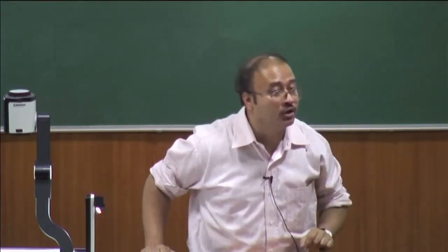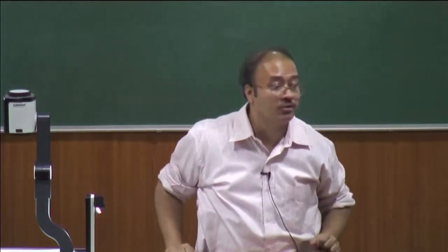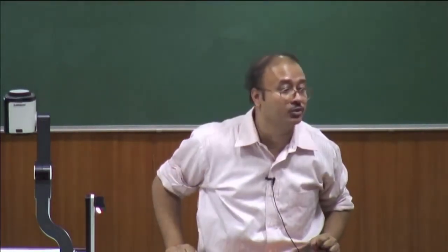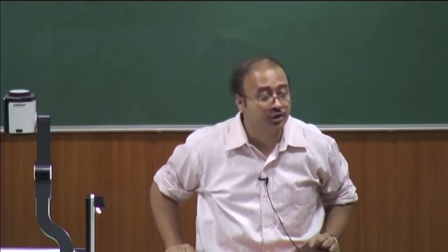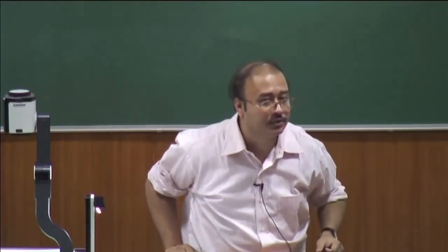But if you would use a deuterium lamp, you will see it goes very high up. So that's why you would use a deuterium lamp rather than a xenon lamp in an absorption spectrophotometer. But it's not that people do not use it. If you want to go to 250 and above, no problem, use that xenon lamp.